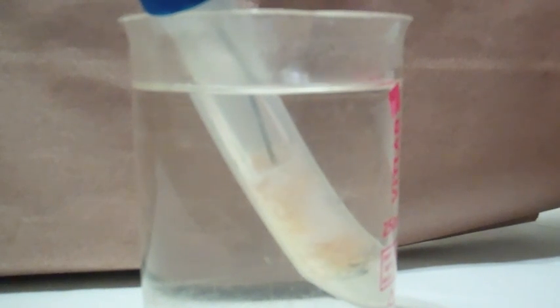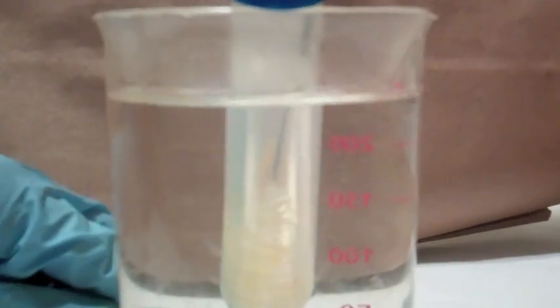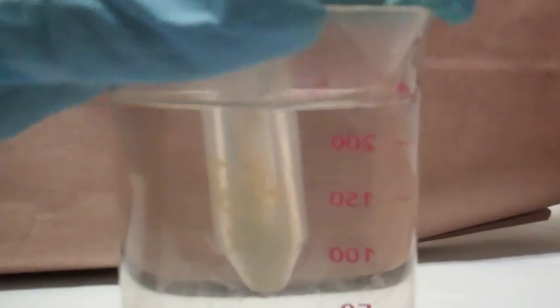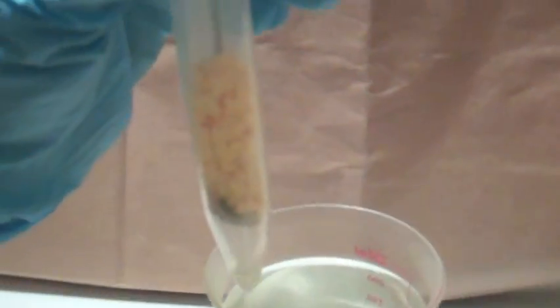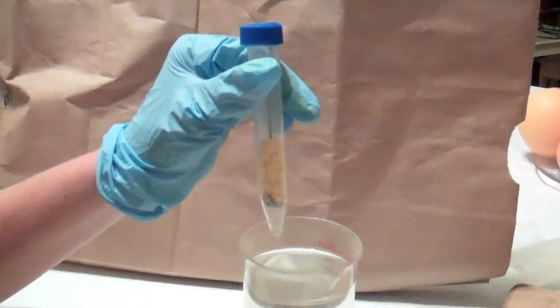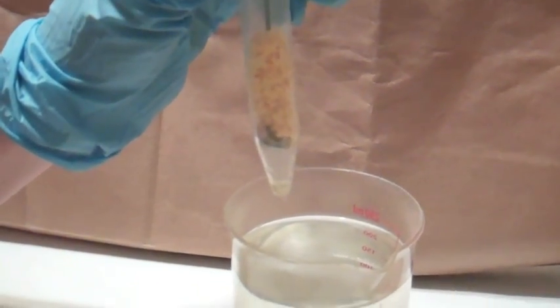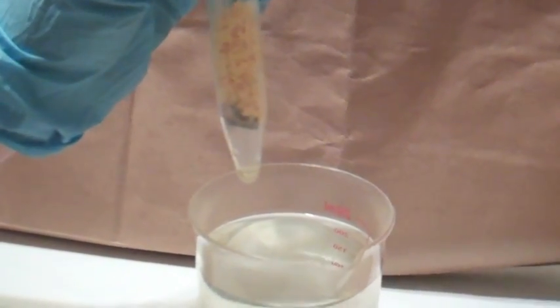That's the first extraction — you can see it, it's really exciting, it's percolating. You can see the D-limonene that's formed at the bottom. Now I'm going to repeat this process up to five times; any more than five times and you really do reach your maximum amount of limonene that can be extracted.